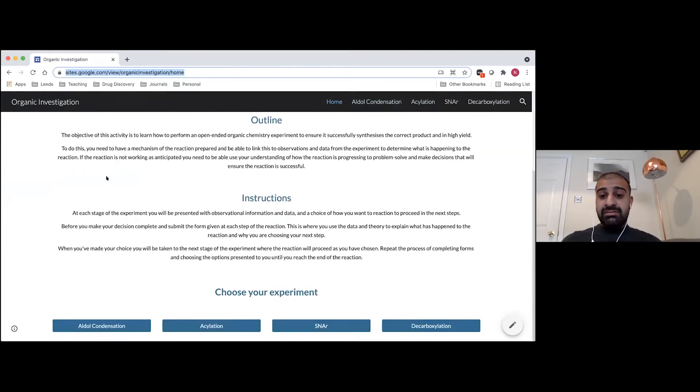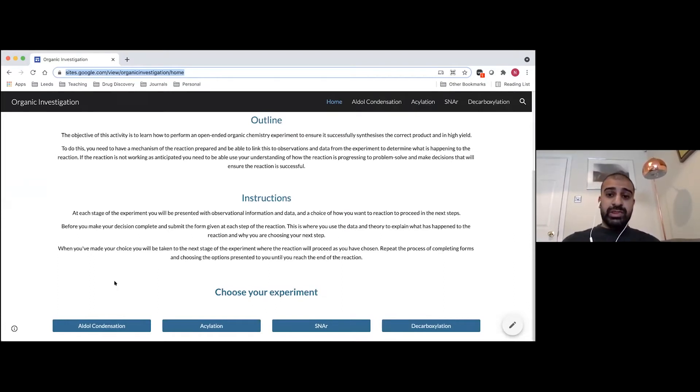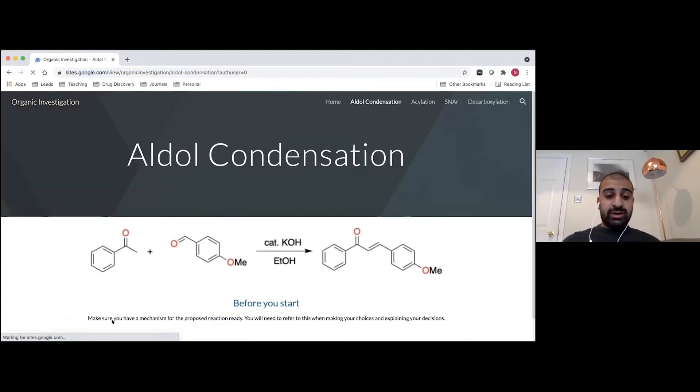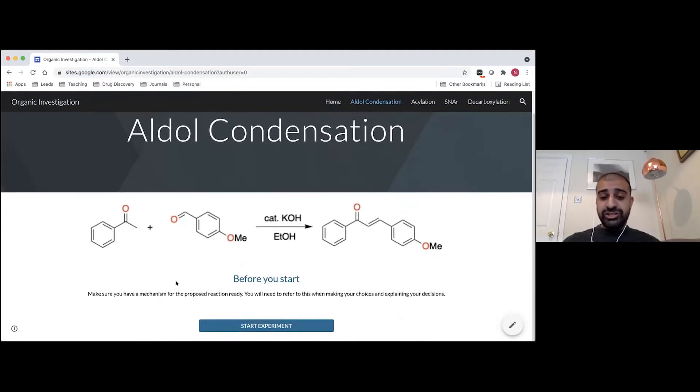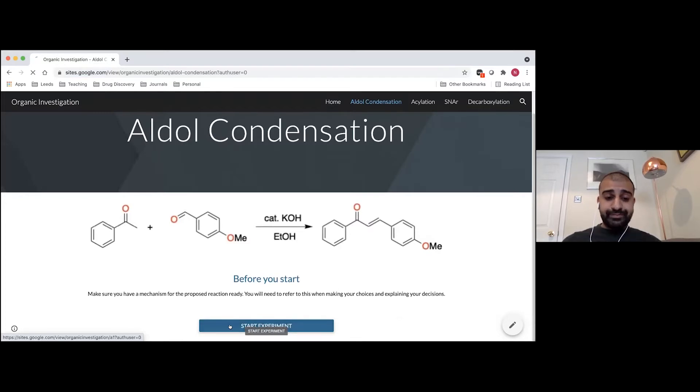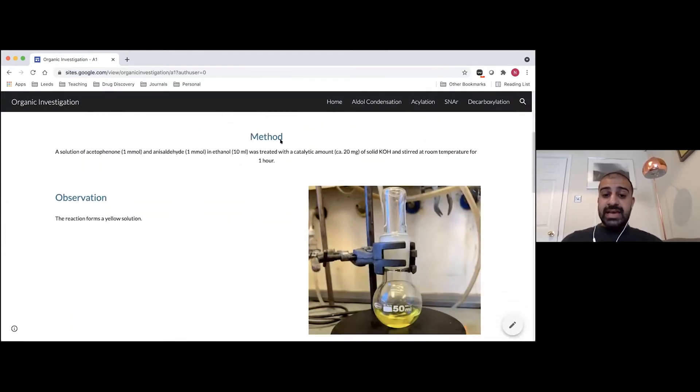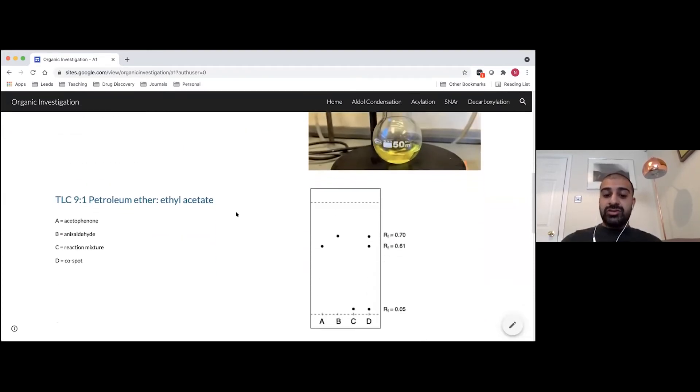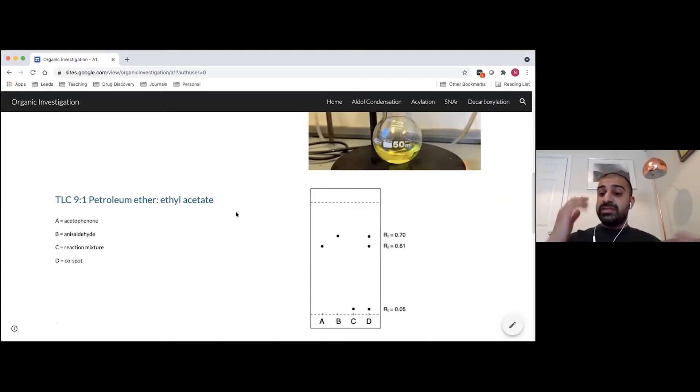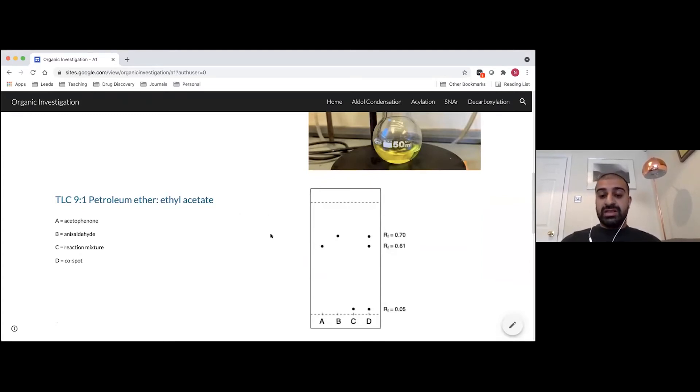It's all web-based, so students don't have to download any software to use them. And the idea is that we've got a set of experiments here, and the students can kind of work through them and replicate those decision-making processes that they would have to with the hands-on inquiry experiments. So if I choose one of the experiments, such as the Aldol experiment, here we've got the reaction scheme about what's happening in this reaction. A student should come armed with an idea of the mechanism of the reaction, how it's going to work. And when they start, what the students see is a procedure of the start of the experiment, and then they get observational data, so what the flask looks like, and their TLC data.